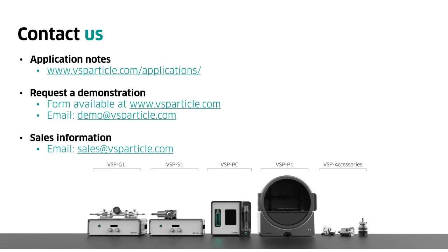That's a good question. How do you ensure that? It's difficult to say, right? At least what we can ensure is that what comes in is just the nitrogen, and typically we're talking about nitrogen and whatever element we have in there. So if we start with clean electrodes, you would expect to have clean particles as well, and you will typically also see clean particles. You would also have to make sure that the gas itself is clean. So if there's any organic compounds in there, you will tear those apart in the spark and you end up with some sort of soot formation on there.